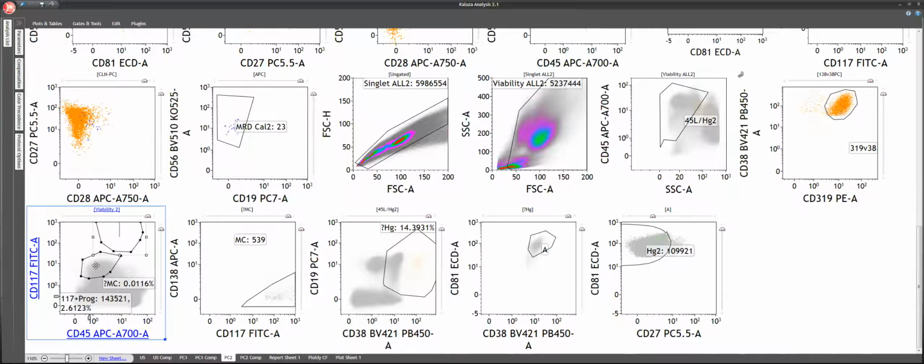So we use multiple parameters, but mast cells and hematogones are more reliable. Third, if those parameters cannot be counted, then we can look at the CD117 positive cells. So generally in our reporting we mention all these parameters because we're still monitoring which is the best parameter to rely on for hemodilution or representativeness of bone marrow.